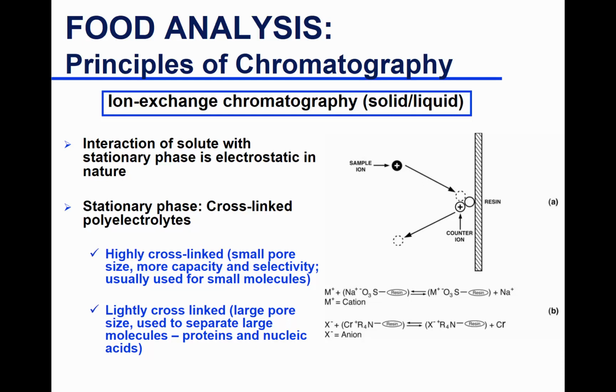Okay. Moving on, ion exchange chromatography, and this is the most confusing chromatography for a lot of students because of how we name them. We name them anion exchange, cation exchange chromatography. The way we name them will deceive the meaning. Are we separating positive charges or are we separating negative charges?